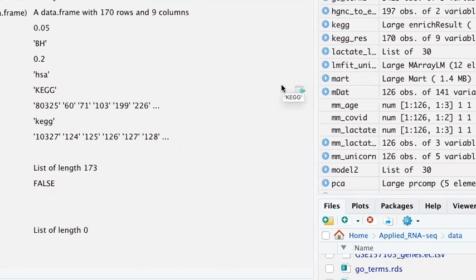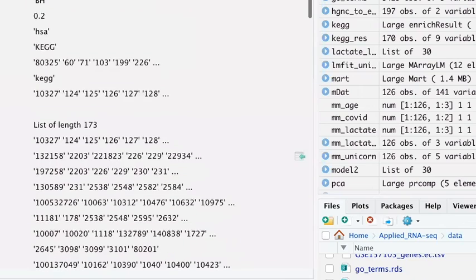So would you then subset out of gene sets, which is a list of 173, with @ result dollar gene symbol? Let's see. If I do that, it's @ gene sets as well. But if you were to pull an individual item from the huge span of gene sets, gene sets is a list.